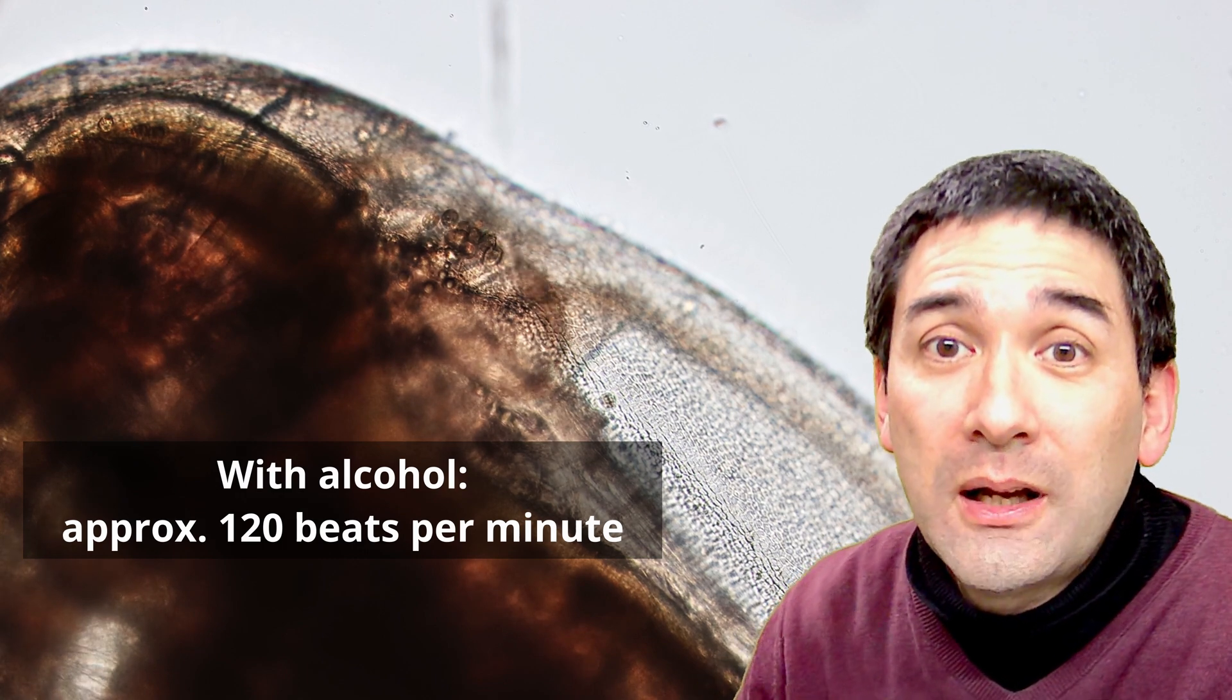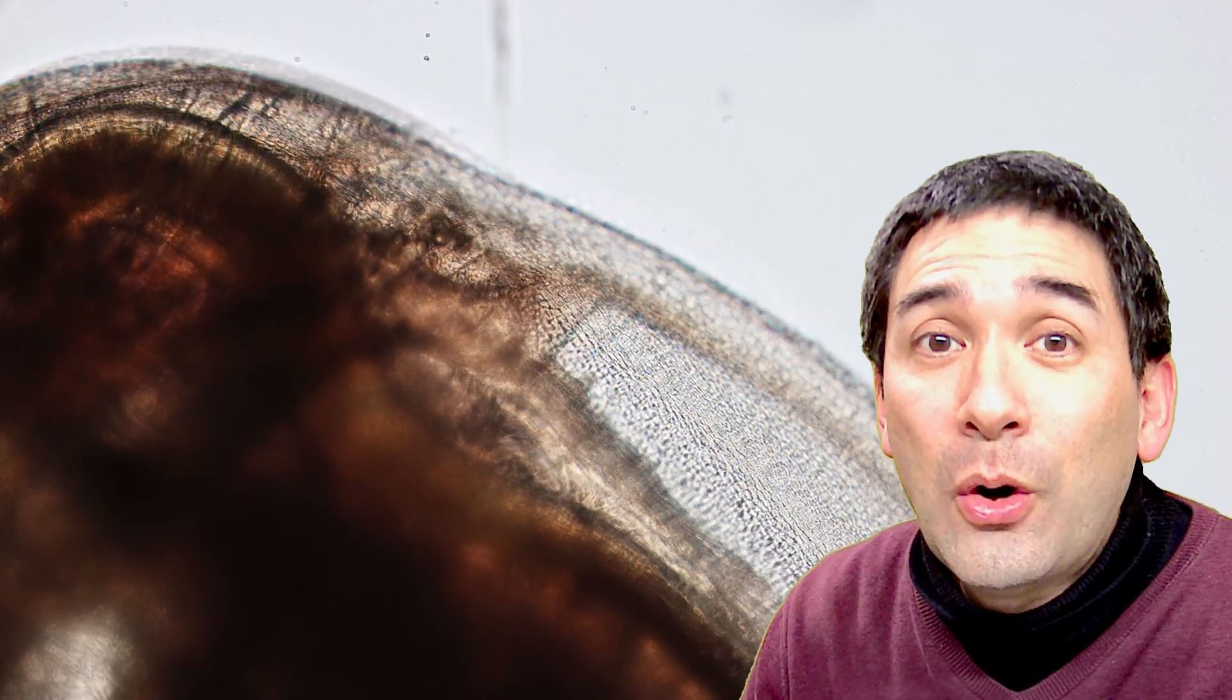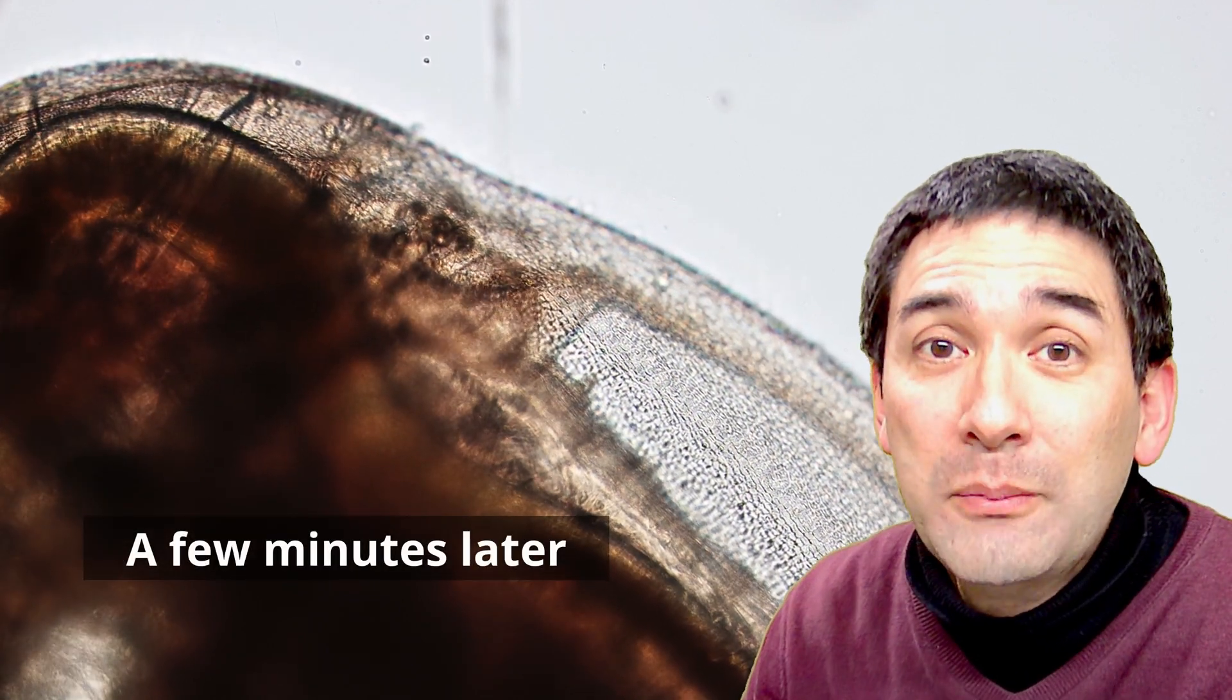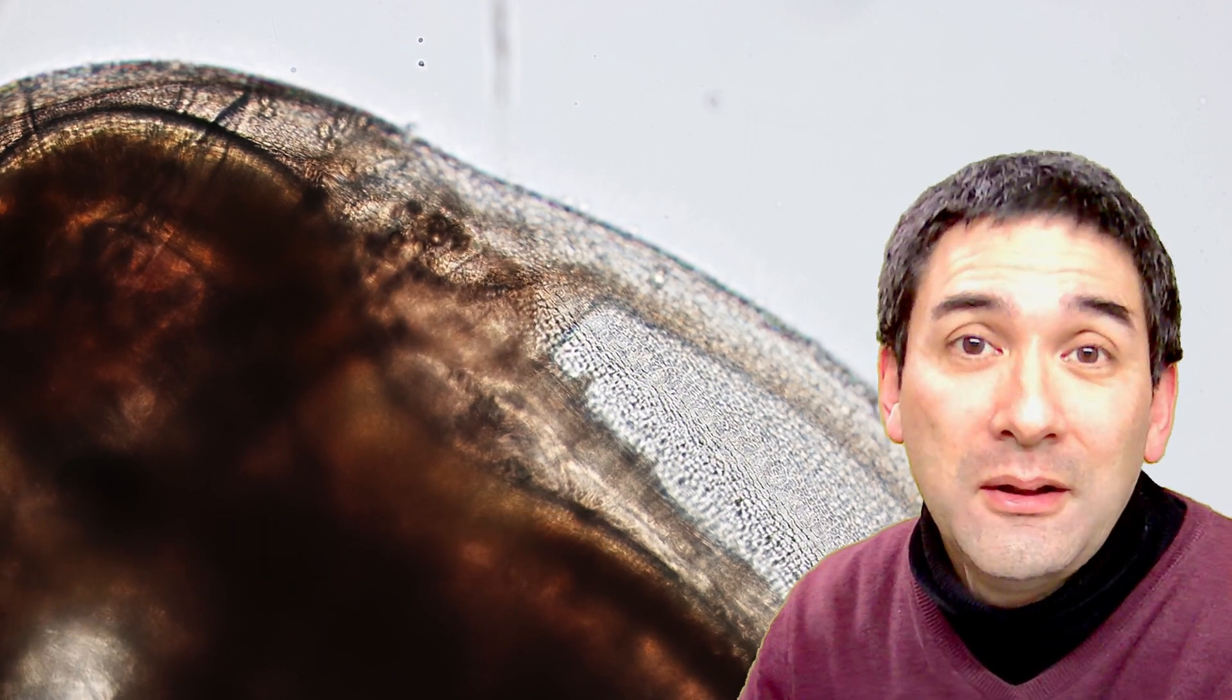And this is then when the heartbeat, several minutes later, starts to speed up again quite back to the original rate.